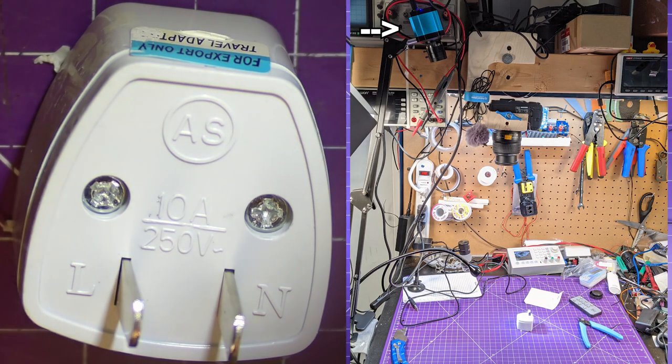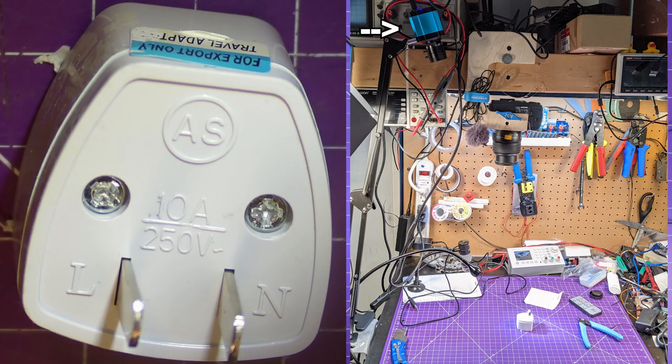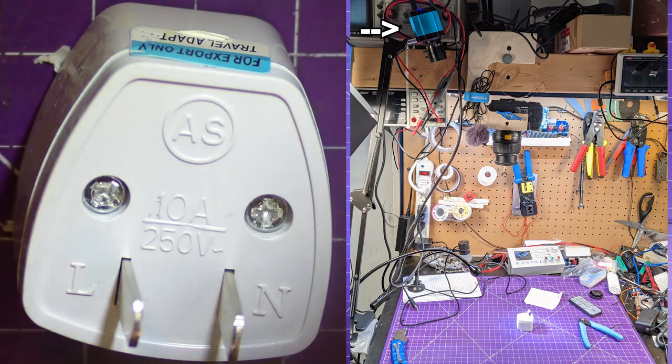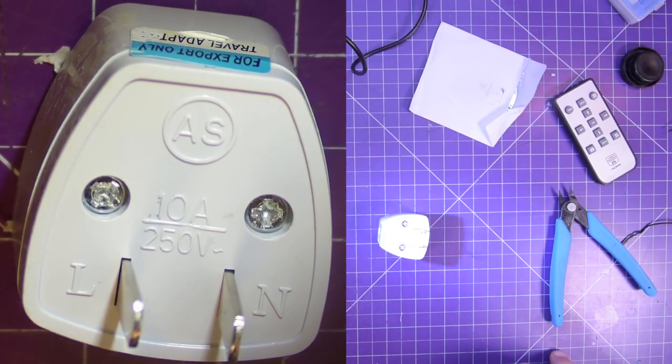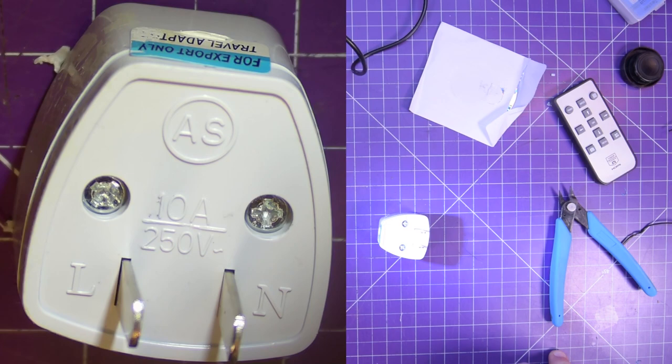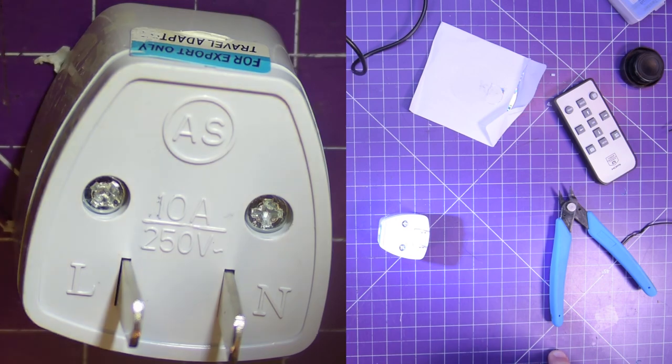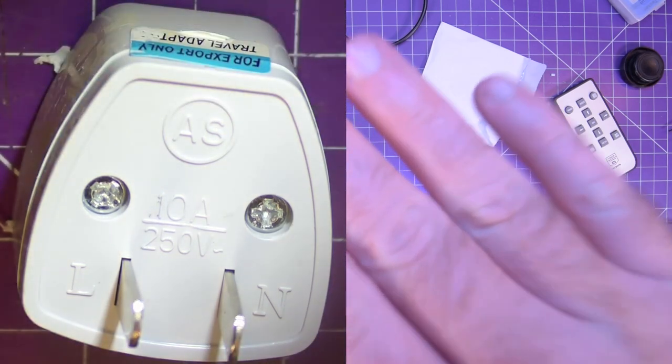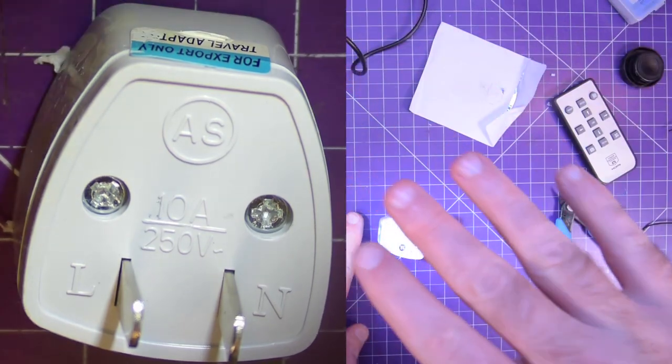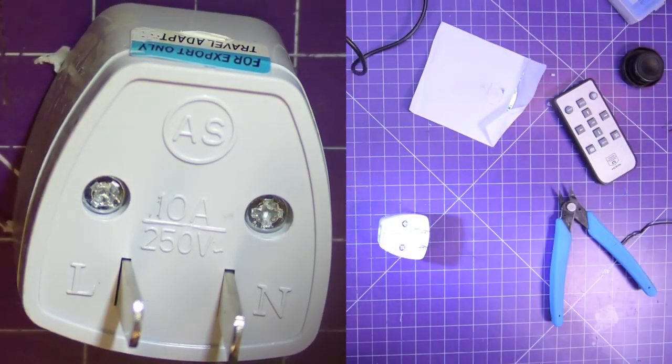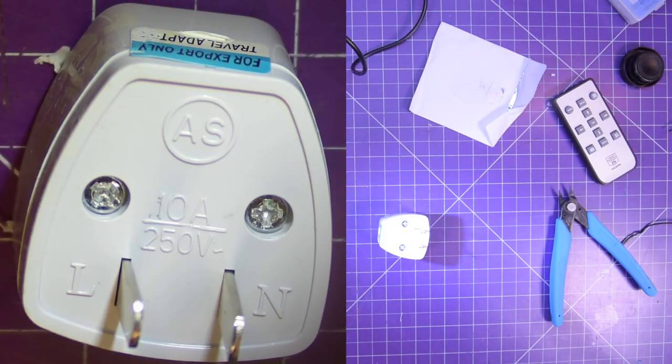As you can see, that's a fairly good magnification. But how good is the working distance? Well, for that, I'm going to have to show you a picture because the range on this thing is insane. Like here, take a look at this. So it's not even in shot. This is above my shoulder. So basically the DSLR that you're looking at the main screen right now, that is shooting from about the height of, you know, like it's under my chin about the, you know, a little bit more than chest height, I would say.